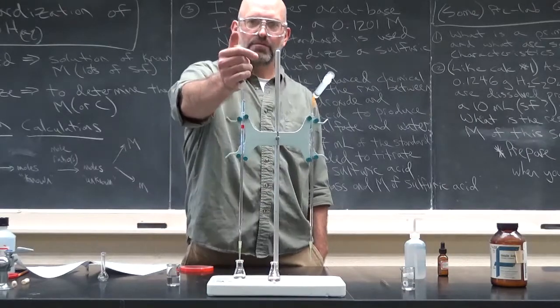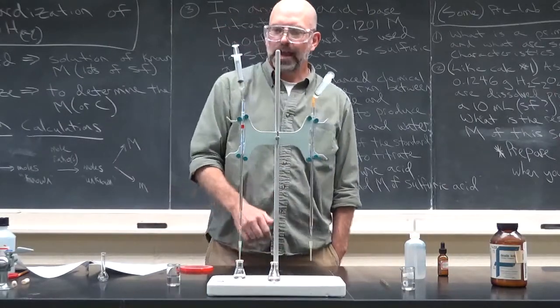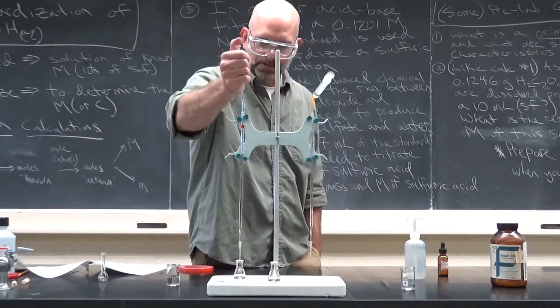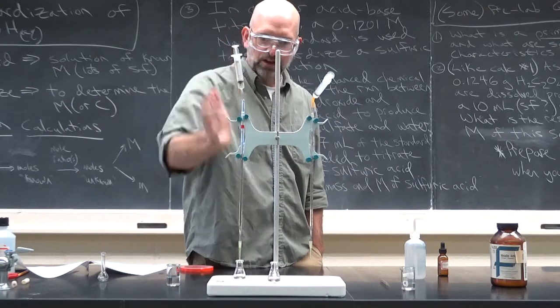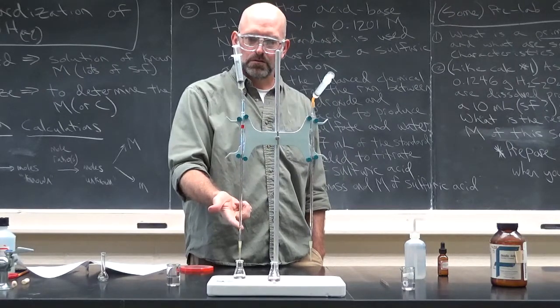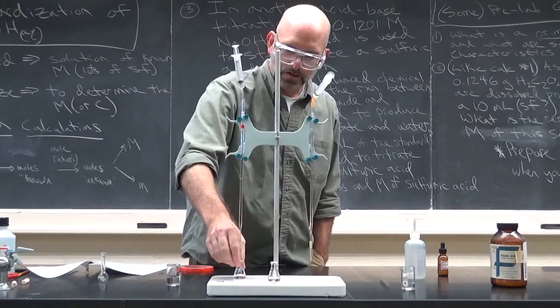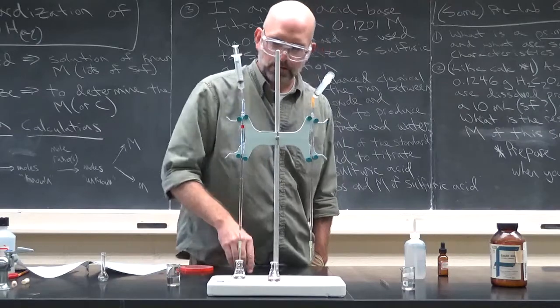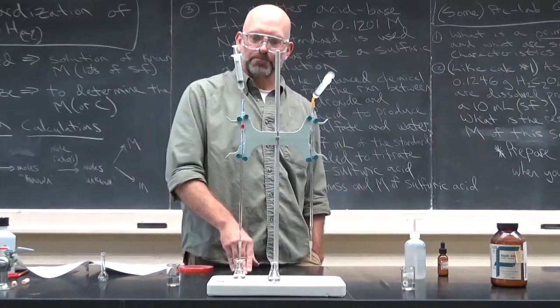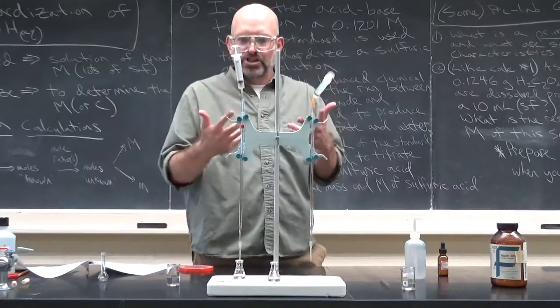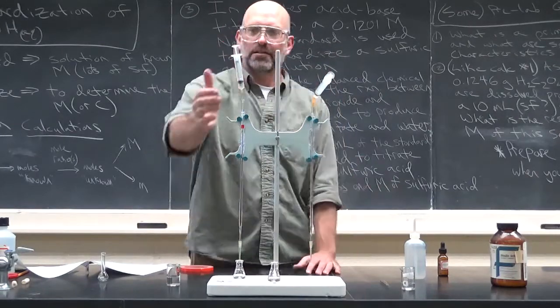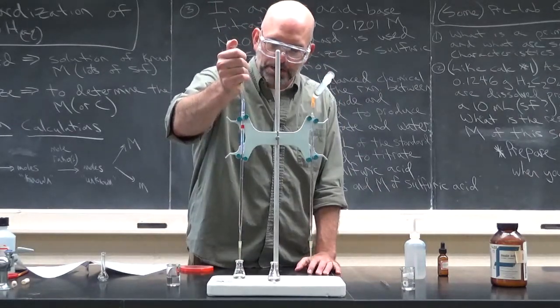Let me describe it in words. Go slowly. Add the sodium hydroxide slowly. And the goal is, let me just add a couple of drops. So I don't know. Can you see it turning pink? Okay. Swirl it. And if you have not reached the end point yet, it'll go back to being colorless because now we've homogenized it and it's not quite done yet.